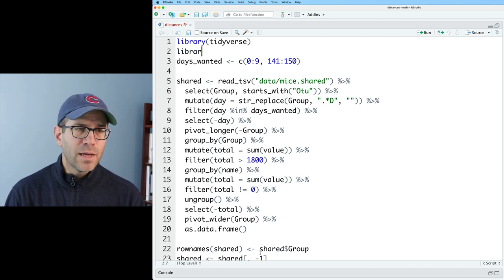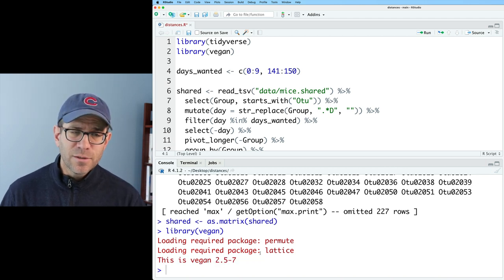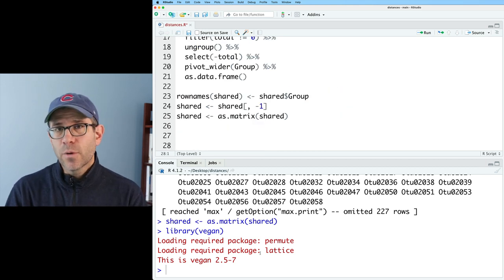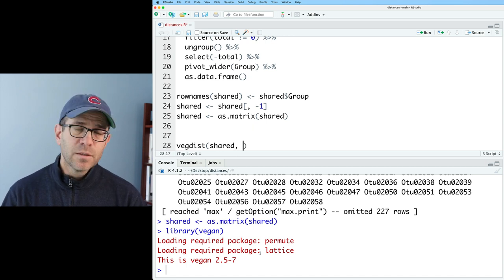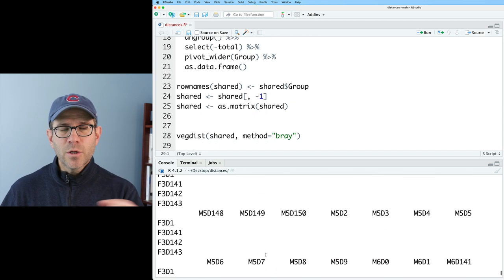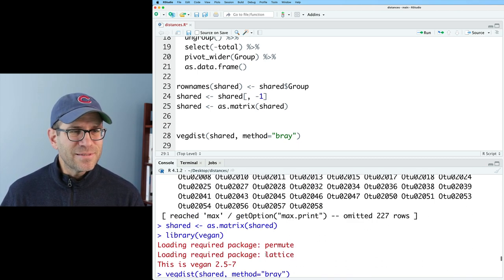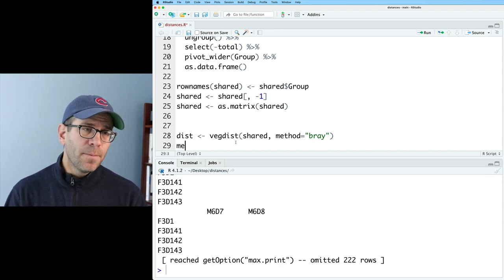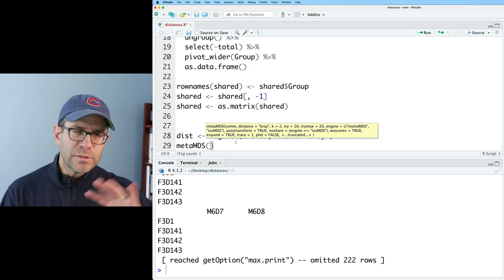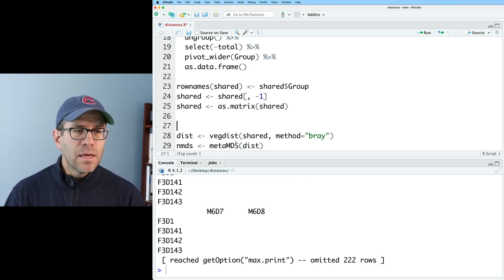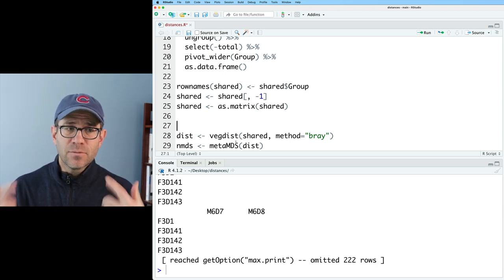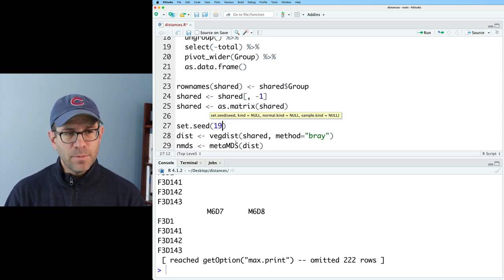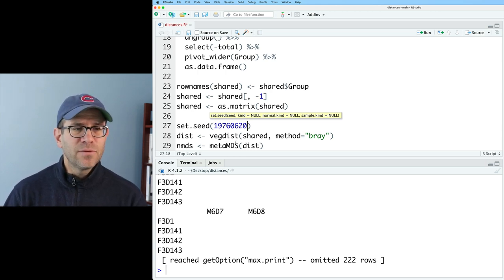So now I'm going to show you how we can use this shared file to calculate distances using tools from vegan. Before we can do that, of course, we need to do library vegan. So the first thing that we're going to see is that we can use vegdist on shared to calculate a distance matrix. To set the type of distance you want to calculate, we could do method equals bray. I'm going to go ahead and save this as dist. So I can then feed dist into metaMDS to do an NMDS. Now because NMDS uses a random number generator, I'm going to go ahead and set the seed so it's consistent run after run. So we'll do set.seed 19760620.